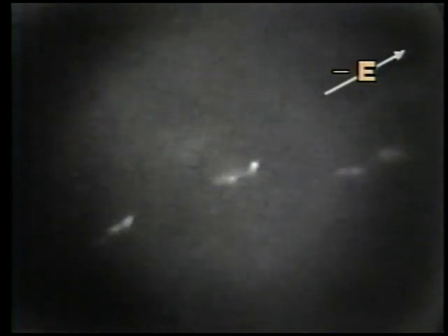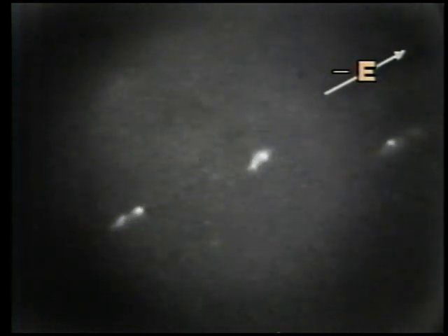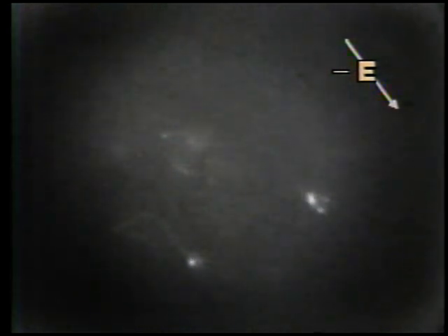Here is a demonstration of corner turning using the smallest yeast chromosome. In order to resolve those longer molecules, all of which came to the same point in our conventional gel photo, the OFAGE technique is employed, where the electric field direction changes periodically. Here the field is switched through an angle of 120 degrees using an array of electrodes around the cover slip. The arrow indicates the direction of the electric field force on the molecule.